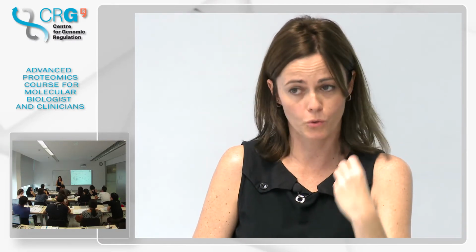If you have a heavy peptide and the small fragments are going to have a different mass as well, is that still okay or not? I don't understand. When you have a heavy peptide and cleave it, the fragment that you are interested in is going to have a different mass. Yes. Can you still use it? Yes, you always have different masses for the light than for the heavy in the fragment, but also in the peptide. Your Q1 is already different because the peptide is heavy. And if you didn't have a different mass, you couldn't distinguish which signal comes from which.